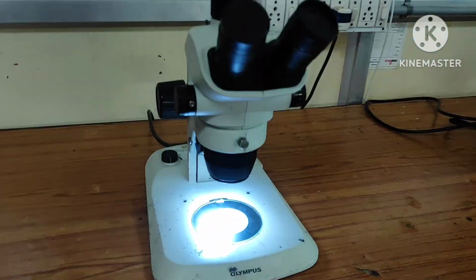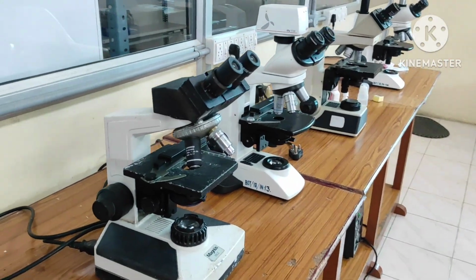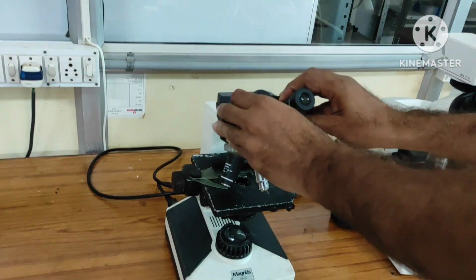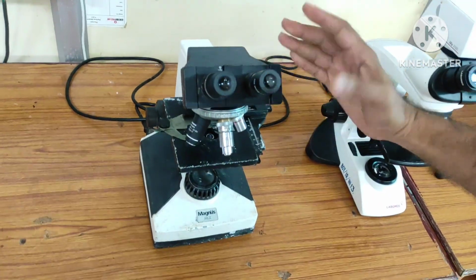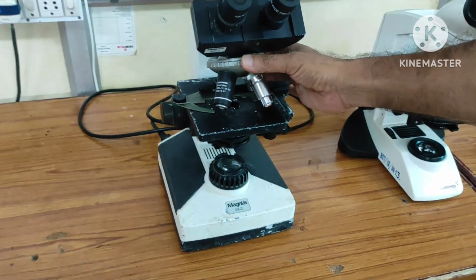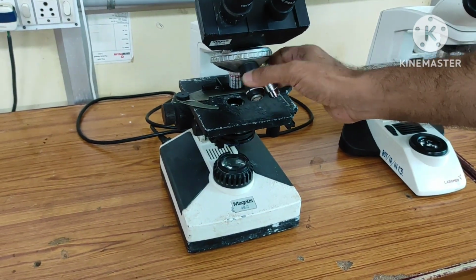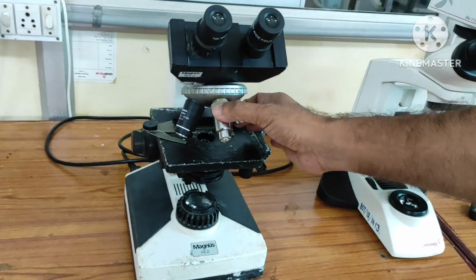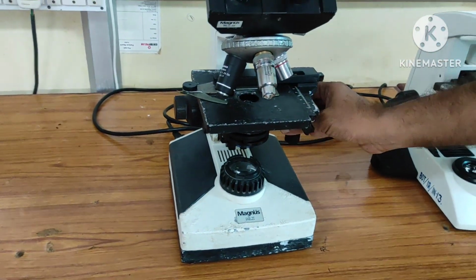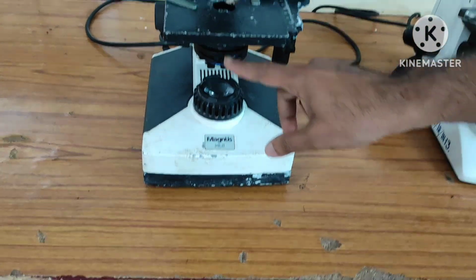So these are some of the very old microscopes we have. Still these are in working condition. See here, right? I think more than 40 years old microscopes are there. Same eyepieces and nose for objectives, movable, right? And 10x, 40x, 100x type of objectives we are putting here. This is the stage. Movement is also still in working condition. This is the source of light, then the condenser, then the aperture to pass the light.